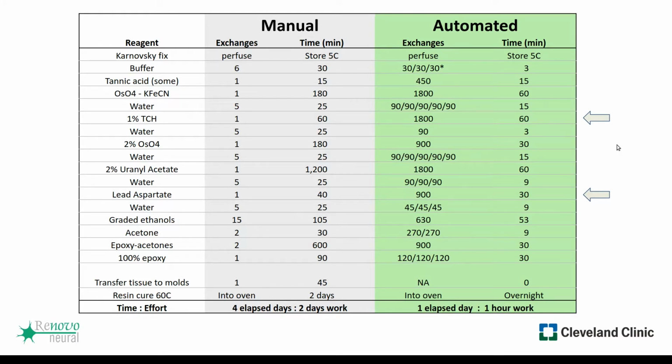And this is a pretty standard serial block-face EM protocol that was used for many of the tissues shown in the next slides. And there was some tweaking in some steps over time, but nothing majorly deviating from this. I may have had about 4 or 5 versions of the protocol saved on the Microscopy Innovations laptop by the time I was done with it. But it was just small things. It's very customizable based on your needs and personal workflow. Also, it's important that you can have some of your tissues go through a certain step while others don't, for example.